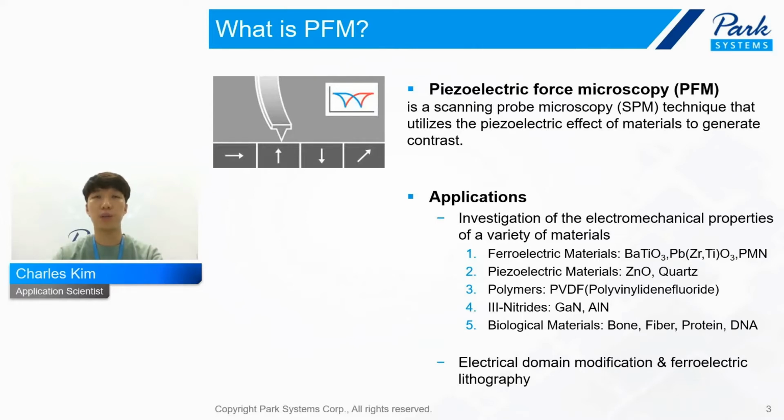And also for a special case, if you want to switch the domain of the ferroelectric material, then you can try electrical domain modification or lithography by using the PFM technique.